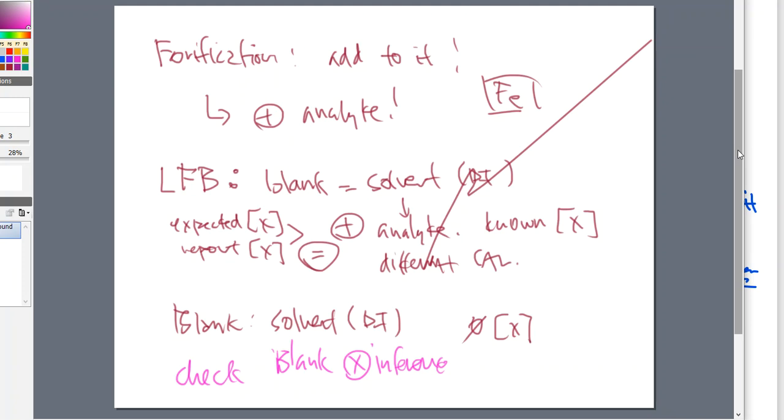One of the ways that I can prevent that or take that into account is if I run a blank that really shouldn't have anything in it at all, and then I run a blank with a little bit of what we're looking for in it, and hopefully it comes out and matches what the expected value should be. If it does not match the expected value, maybe I messed up on sample prep. Maybe I need to do it again. Or maybe that solvent is interacting with the iron or the thing that I'm looking for, and maybe it's interfering with the reporting and interfering with the signal. So this helps me make that judgment call, and that's why the laboratory fortified blank is important.